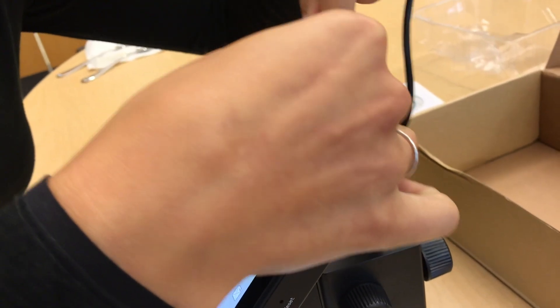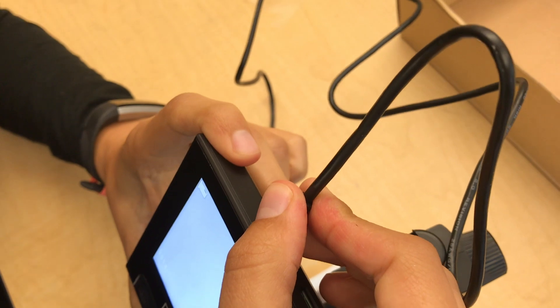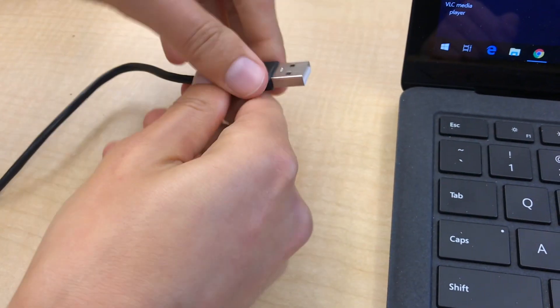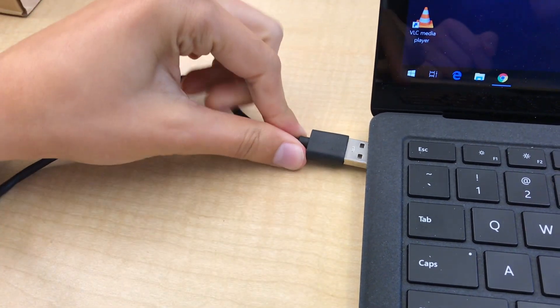If you want to take pictures or videos of what you observe under the microscope, plug the small end of the cable into the top of the microscope and the other end into the USB port of your computer. You can also record onto an SD card which inserts into the top of the microscope. Otherwise, you can skip this step and just use the microscope.